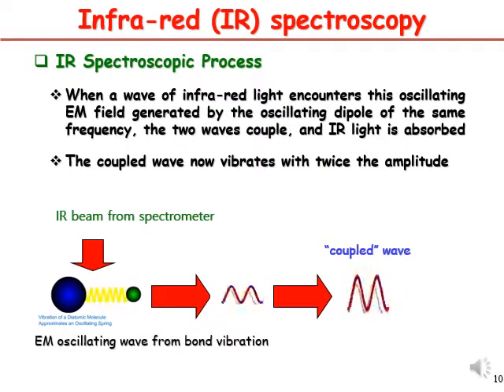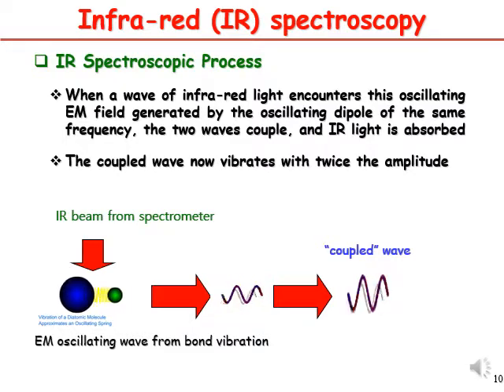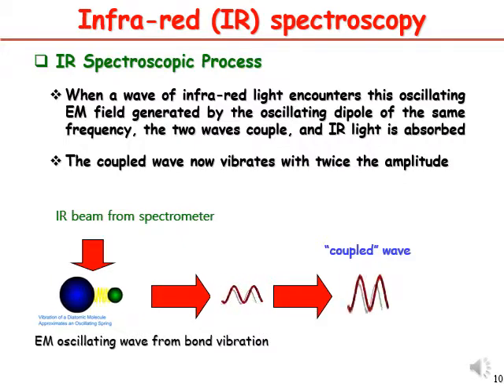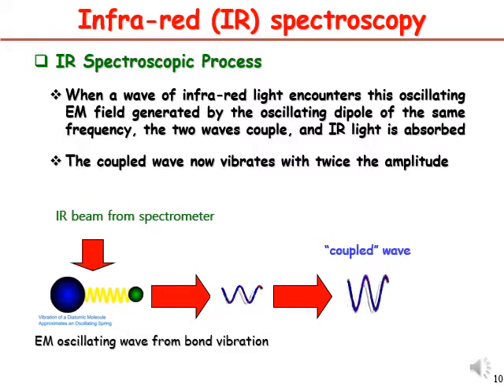Now we go for the next part. By the time the molecule absorbs the energy from the infrared light, it will start to have this kind of oscillation or vibration. As you increase the energy of the infrared light, the amplitude or the motion will also increase.